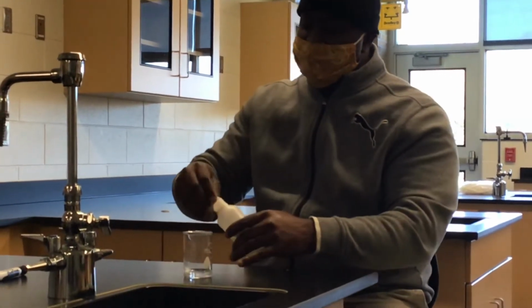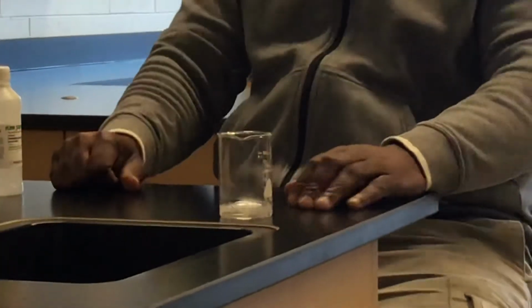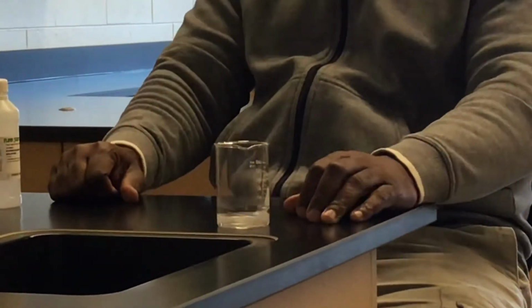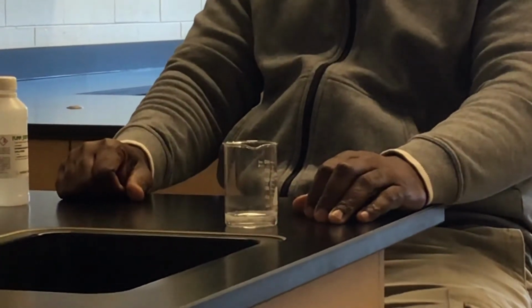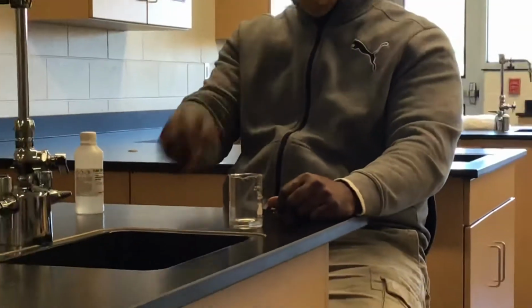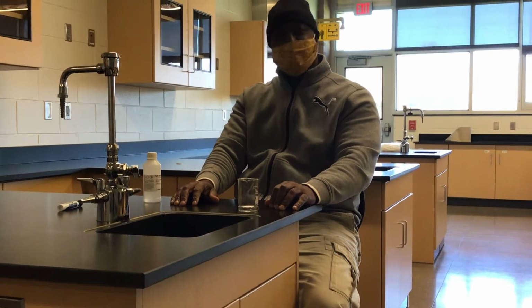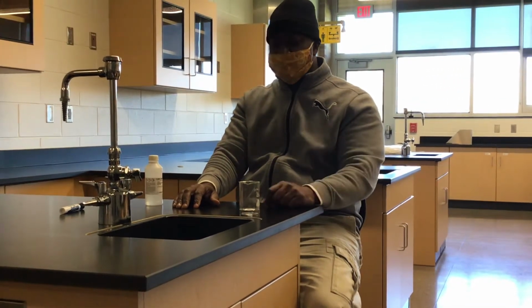I'll use a liberal amount and you will notice something. Something that indicates that there's a chemical reaction occurring. What do you notice? Yes, you're correct. Vigorous bubbling. Very nice. But now the bubbles are gone. And so is the magnesium. Intentional or big accident? That's the question.